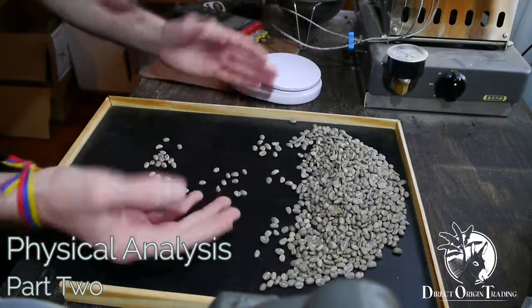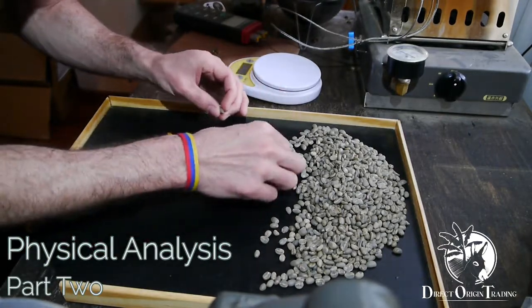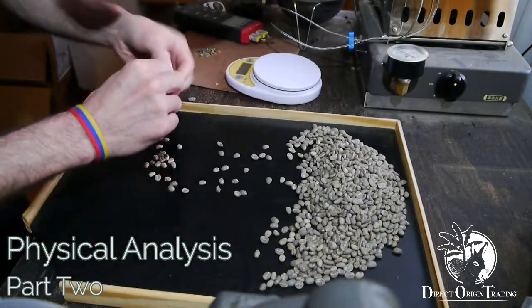We already know these are good size beans, so I'm not looking for size. I'm just looking for all the defects, all the physical defects that we could have in these.